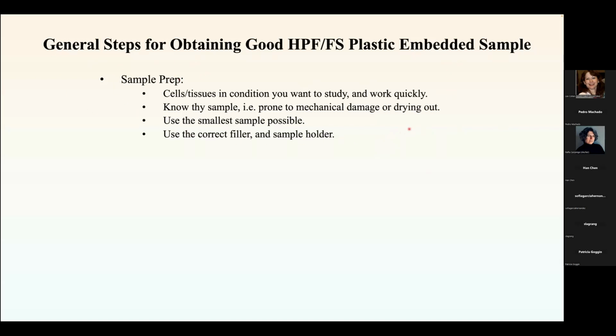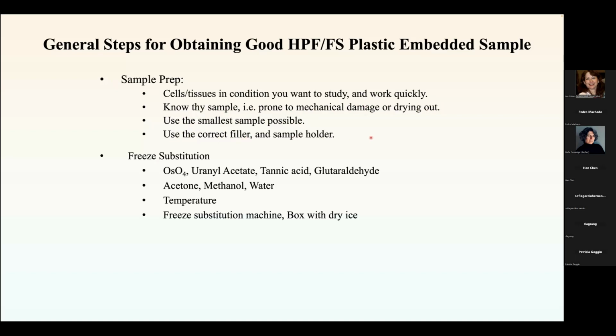Going back over sample prep: you want to work quickly. Know your sample. Is it prone to mechanical damage or drying out? Then you have to take steps to prevent that. Use the smallest sample possible. Use the correct filler and sample holder.